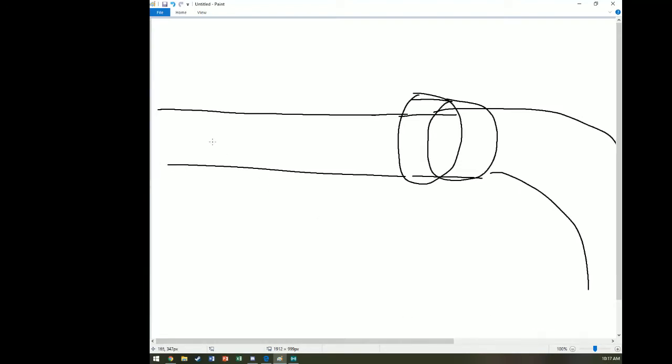The way a mass spectrometer works is that you have a magnetic field here. B, we use the symbol B in physics to denote a magnetic field. So we have a very strong magnetic field, and if you have any charged particle, be it positive or negative, that magnetic field will exert a force on the charged particle, and as a result it'll push it along this curve. We can measure the mass based on how much the force deflects the charged particle's trajectory.